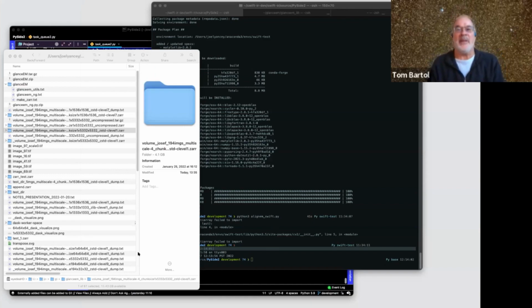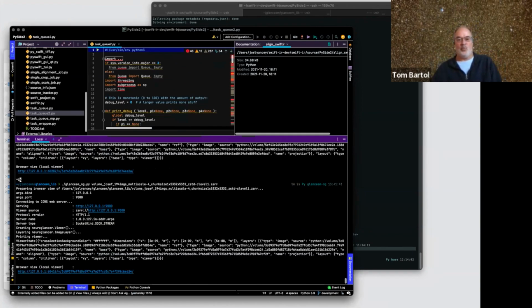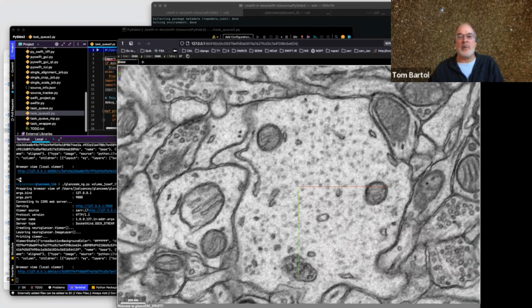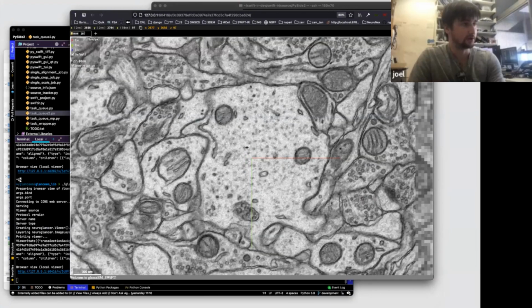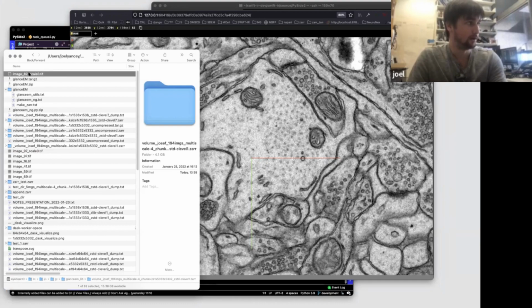Sure. So it starts in the middle of this stack. If you look at the Z right there, the Z dimension, it shows I'm on image 97. Then there's 190 something images. So let's say I'm on image 82 right here, then I use the U key, which stands for unchunk. If I press that, then we'll see the directory that I'm working in. We get the unchunked version of it.